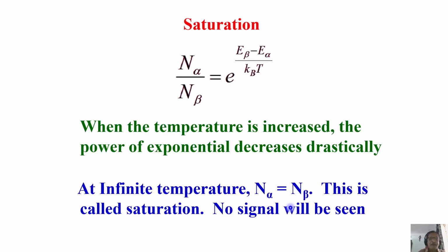How to enhance the sensitivity? I've already told you. Play with the magnetic field. We calculate the population ratio. When you double the magnetic field, take it to 4 times. We calculated the number. Though the number appears small, but in the realistic spectrum we saw it is nearly threefold rise in the sensitivity by doubling the magnetic field. At the same time, when the temperature is lower, we know that at very, very low temperature, the population in the lower energy state becomes significantly high.